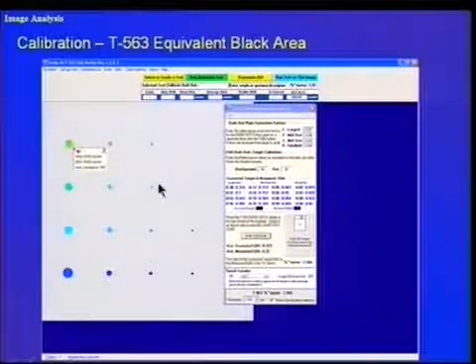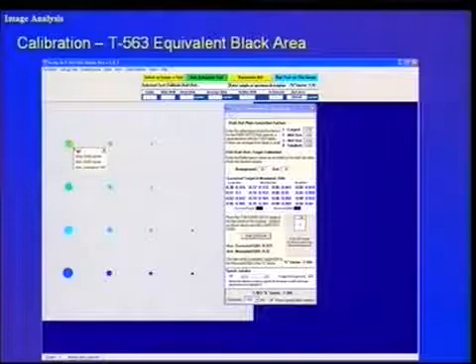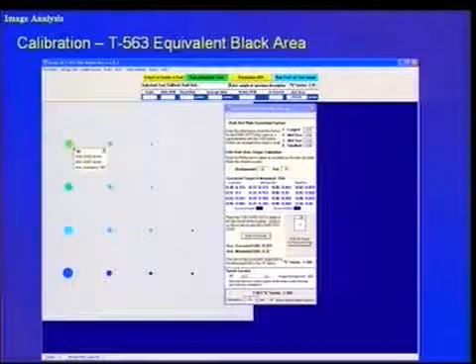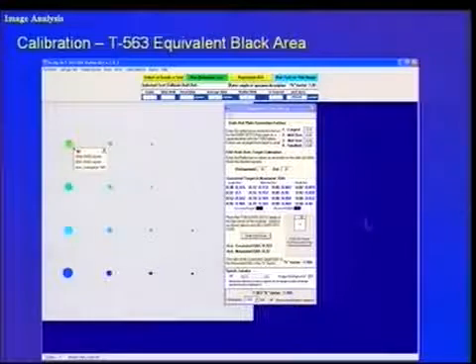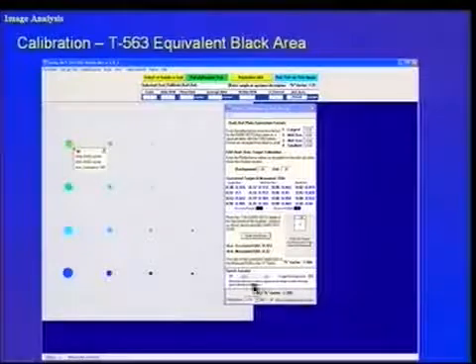The chart originally is gray, and I will show you that during the lab phase of the series. The chart is scanned in initially during the calibration phase, and down below is the K factor called out in the specification that is calculated from the chart.